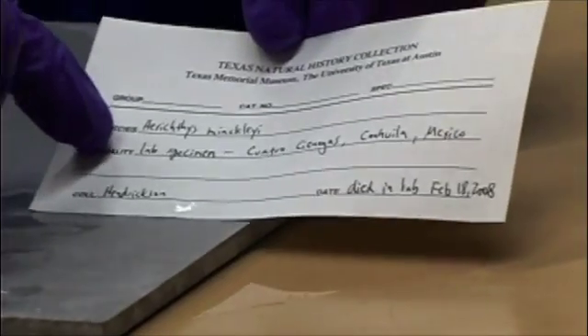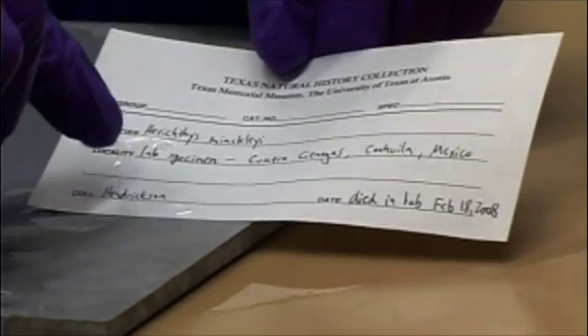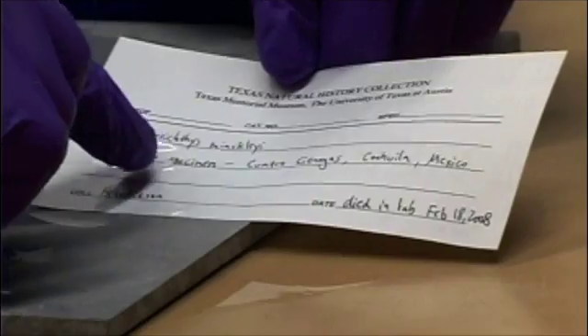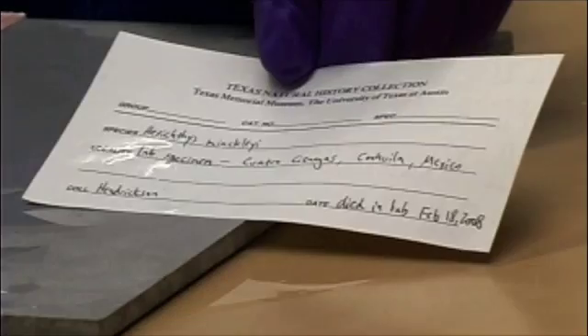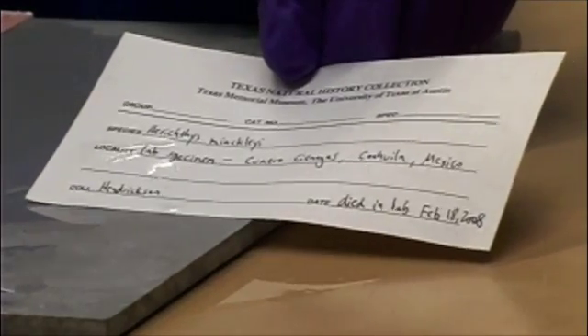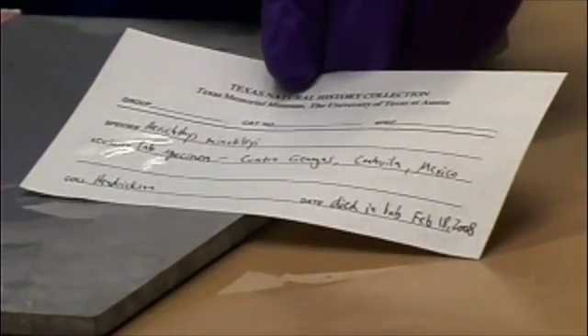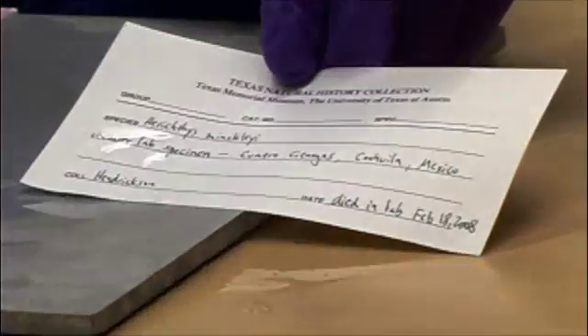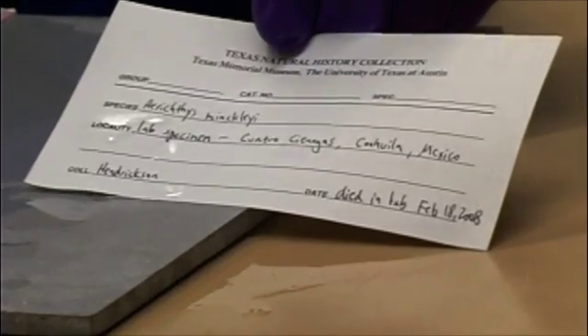I've included the species name, Herichthys minckleyi, and the locality information — in this case it was a lab specimen collected from the Cuatro Cienegas Basin in Mexico. The collector was Dean Hendrickson, and it died in the lab on February 18, 2008. Usually we would also write when it was collected, and we'll have that information associated with the specimen in the database as well.